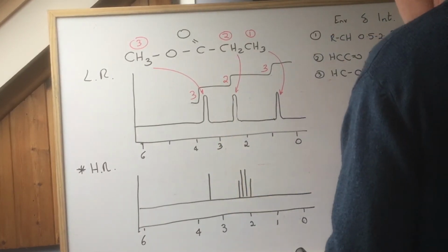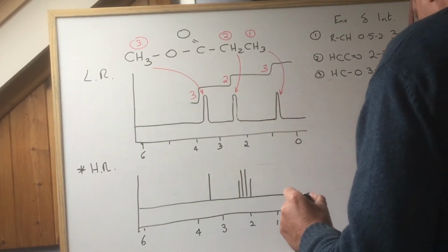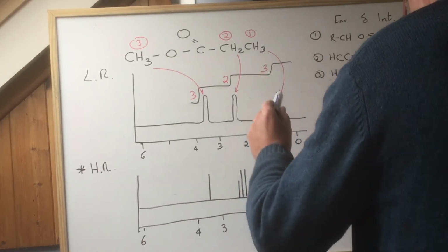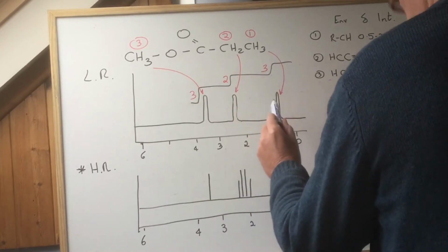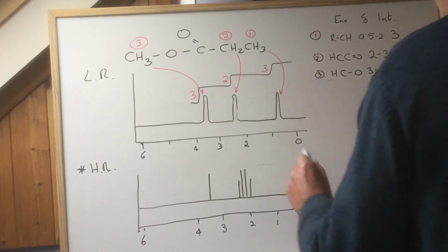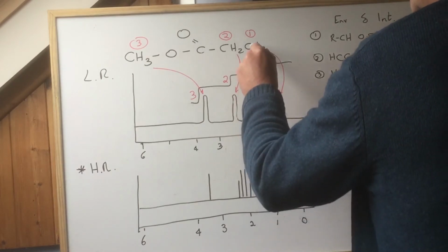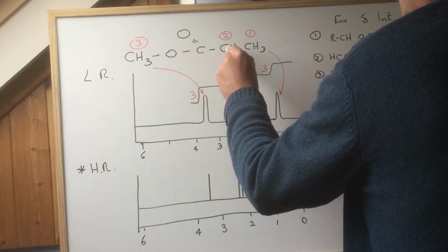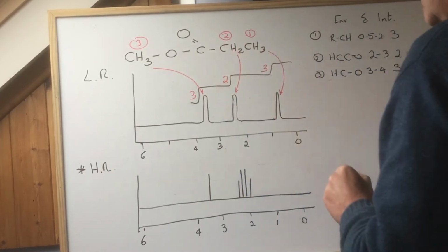So those of you who are on it, look at this one next. 3 protons in that environment? Certainly. Attached to a carbon. Does the carbon have an adjacent carbon? Yes, it does. Does the adjacent carbon have protons on it? Yes, it does. How many are there? 2.